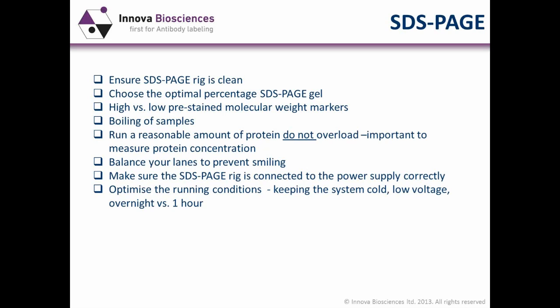And many a time I have benefited from this simple knowledge. Understanding exactly where your protein is in regards to its size allows you to engineer an optimal SDS-PAGE gel protocol and also a running performance.